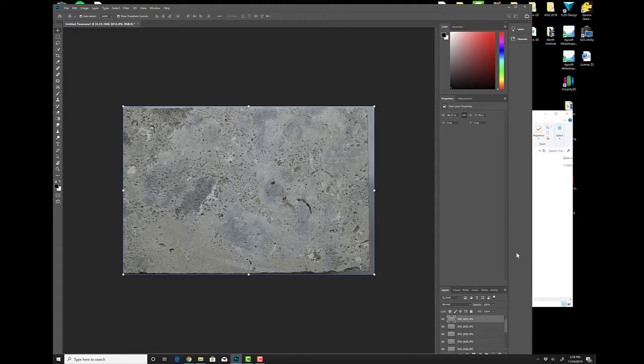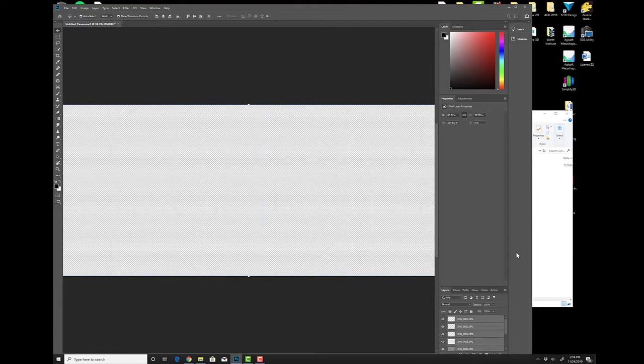Now, because we're doing a panoramic, most people do understand that you need to capture some of the information on either side of the photograph so that there's enough information to overlap and apply. Now, in the following 2 videos, we're going to go through XYZ scanning, and we're actually going to use the field of view to actually speed up the entire capture process. So that field of view is going to be very, very important when understanding how much overlap we need. And in all cases, we're basically going to multiply our field of view by a factor of 0.8. That way there's always 20% overlap in both stitching and in both panoramic imaging. But we'll get there when that time comes.